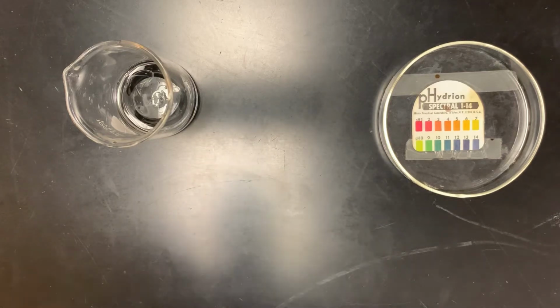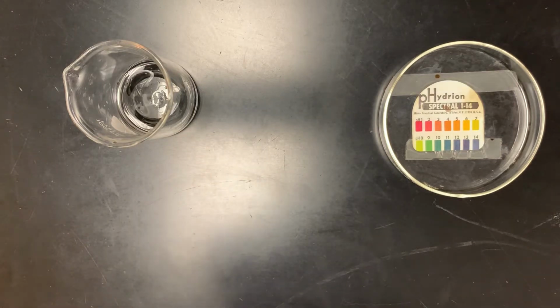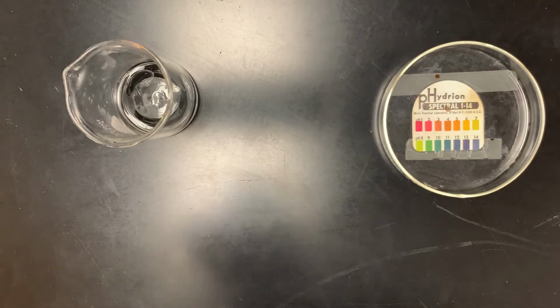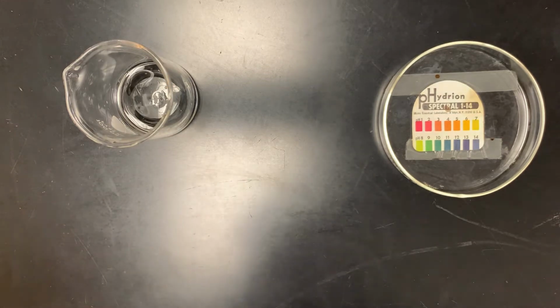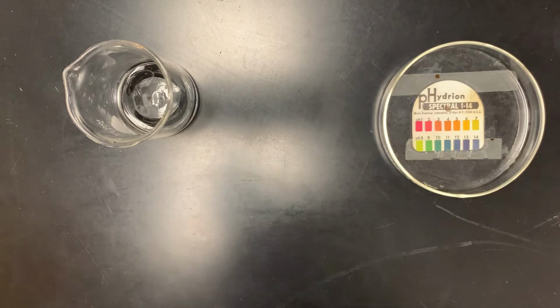Hey guys, today we're going to look at the pH of a couple different salt solutions. And the purpose or the goal of this part 3 of our acid-base salt pH lab is to investigate the effect that a cation or perhaps anion has on the pH of a solution, right? So its ability to generate either hydronium or perhaps hydroxide. Or we'll investigate that some of these salts actually really have no bearing on the pH.